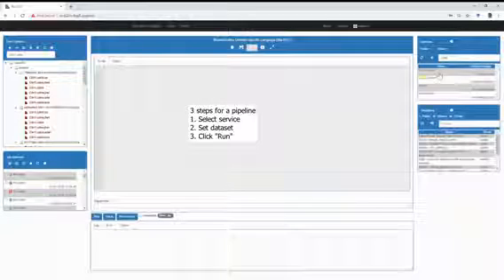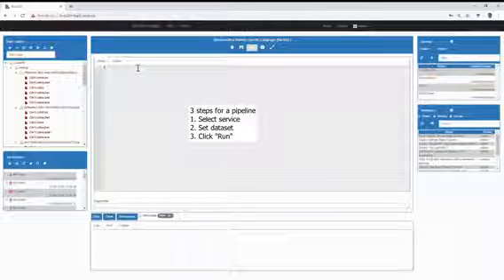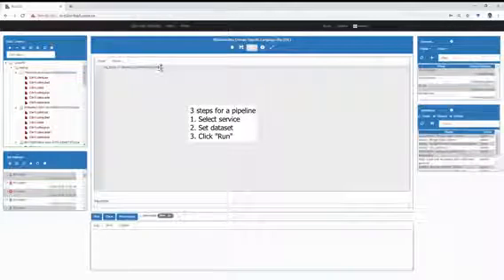Now let's look at an example for quality checking and visualization of gene sequence data. First, you have to search Check Quality or FastQC in the Services panel and double-click it. Then delete the data parameter and leave the cursor there. Search for a certain FastQC file in the data sources and use the right-click context menu to copy to editor. And your code editor should look something like this.